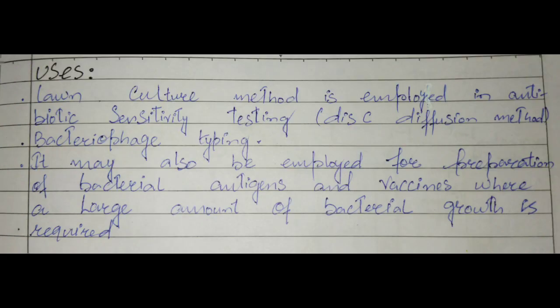अब यूजेस देखेंगे लॉन कल्चर की. लॉन कल्चर मेथड is employed in antibiotic sensitivity testing, disk diffusion method, bacteriophage typing. It may also be employed for preparation of bacterial antigens and vaccines where a large amount of bacterial growth is required.